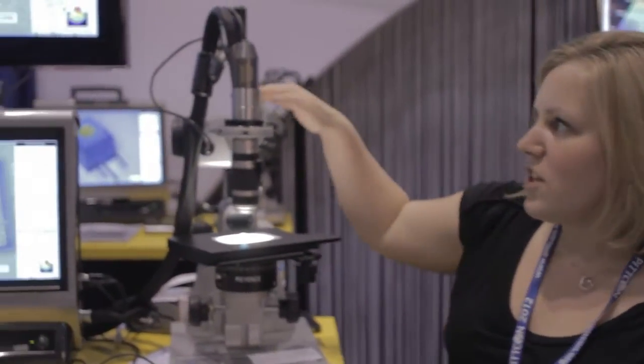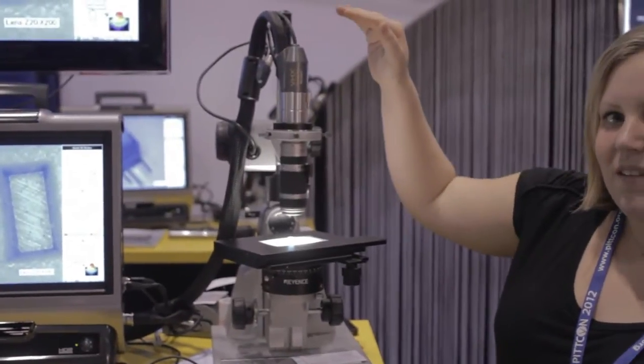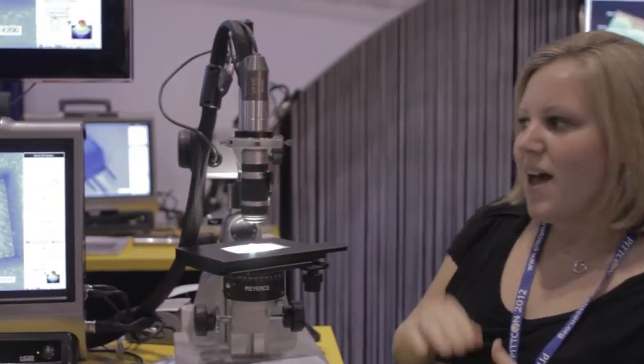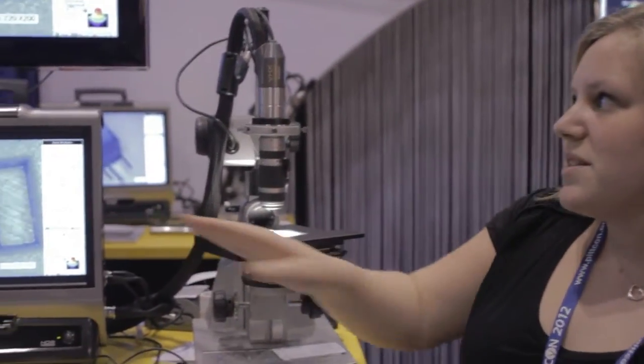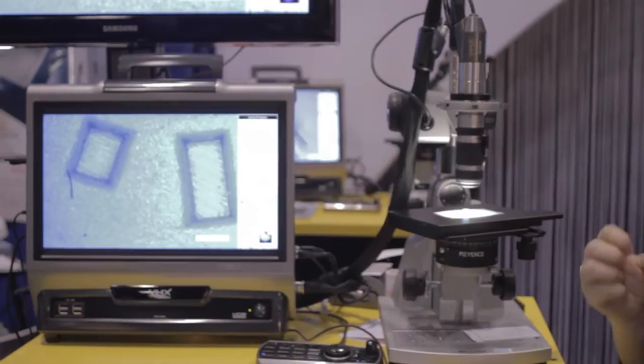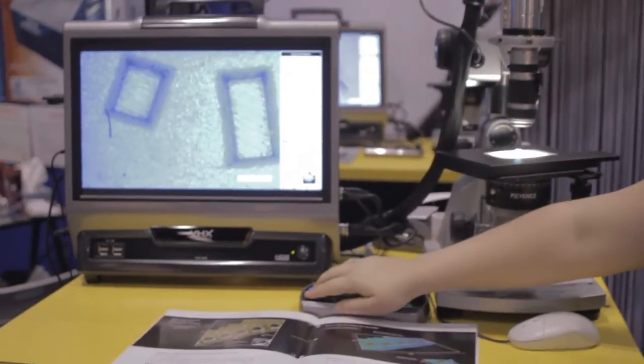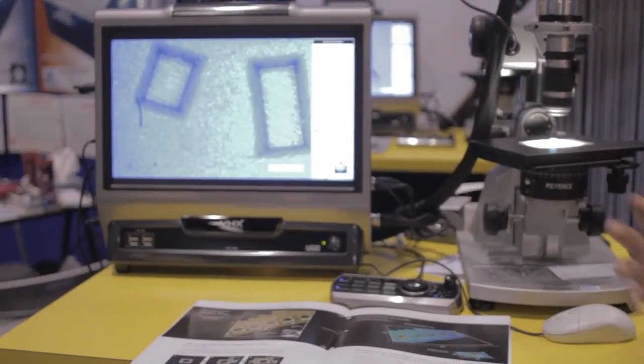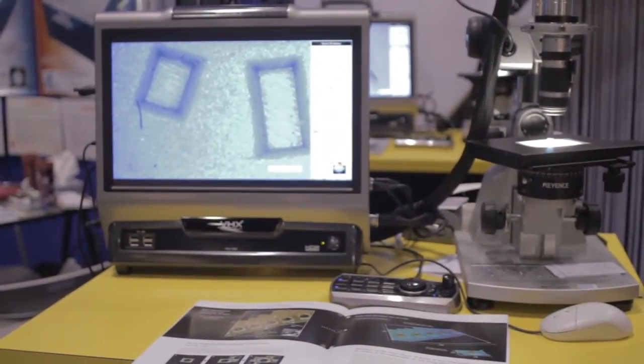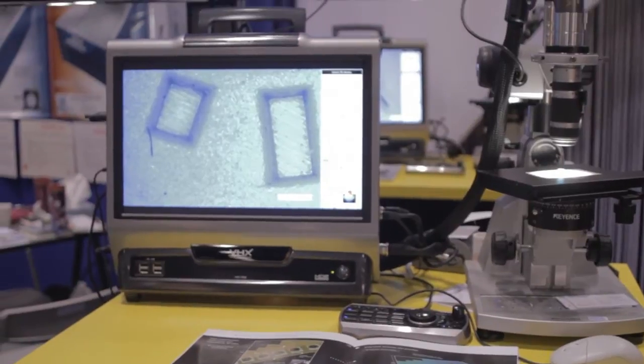So there's actually a motor here that's currently moving the lens upwards. And the system is going to be scanning those pixels, latching onto them with their optimal focus, to create a fully focused image even at those higher magnifications.